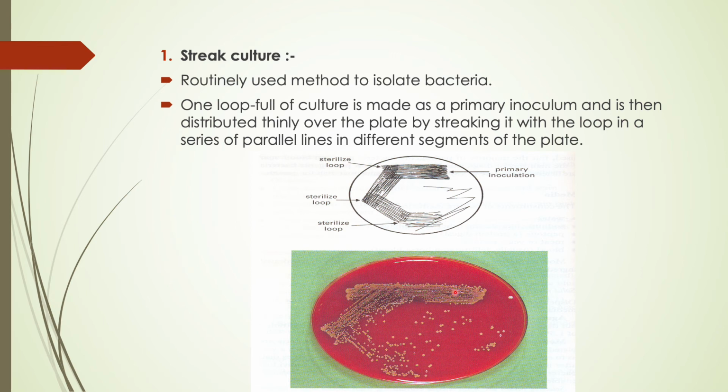So to purify and to dilute the bacteria, what we should do actually, we have to start. This is our colony, so we have to distribute the bacteria to this line, sterilize the loop, this line. So the amount that has been taken from this line is lower than this amount, right? Smaller than this amount. Why?